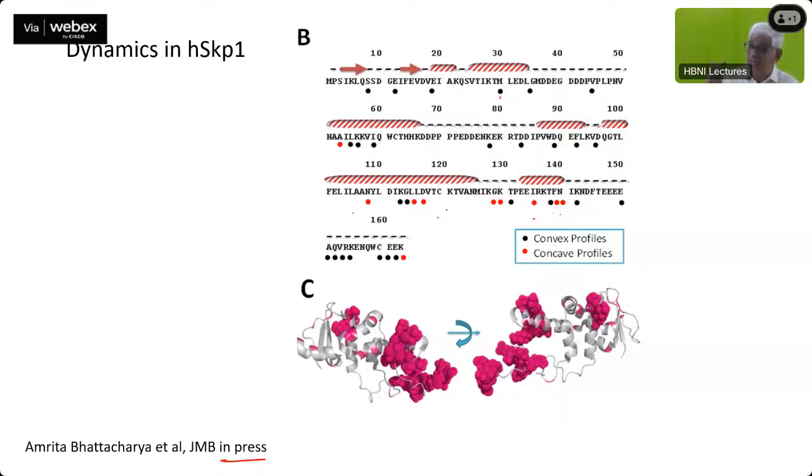The initial delta 1 0 and delta 2 0 determine whether it is concave or convex, and accordingly the chemical shift will change in that manner. If it is concave, the residual is initially negative, then positive. In the other case, it will be initially positive and then negative. So it is not linear.